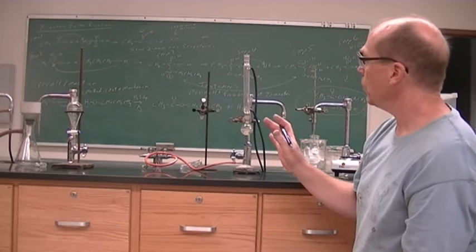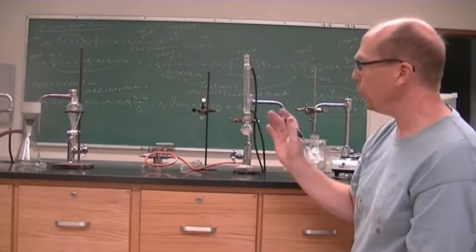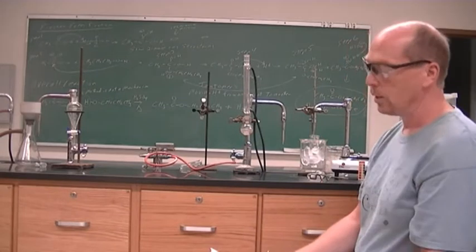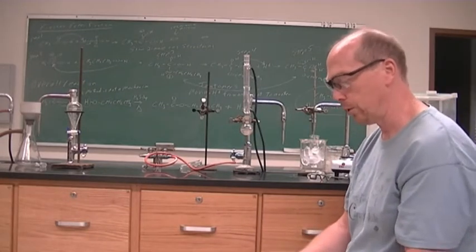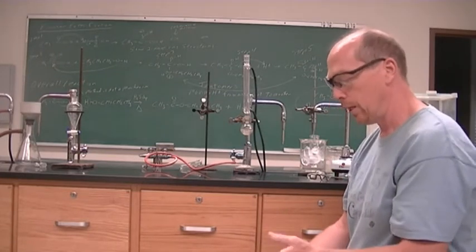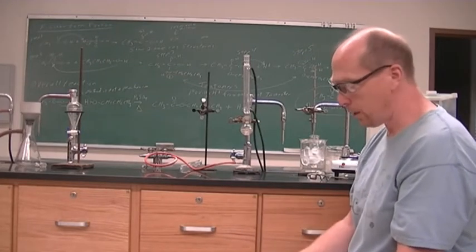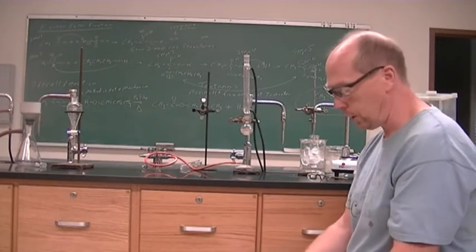All right, so when you're doing your limiting reagent theoretical yield, you only have to use the alcohol and the carboxylic acid. Those are the reactants. You do not need to put in a catalyst. It will never be a limiting reagent giving you the theoretical yield. So it's only the reactants that we need to see how much product can be formed. All right, so that's the amounts that we added in there. Now we reflux it. It's been going for an hour, so we're ready to start the next step.